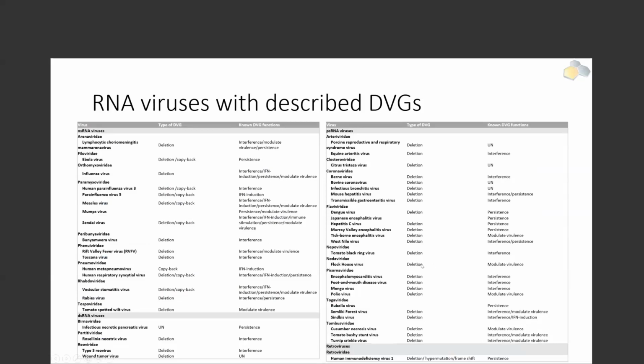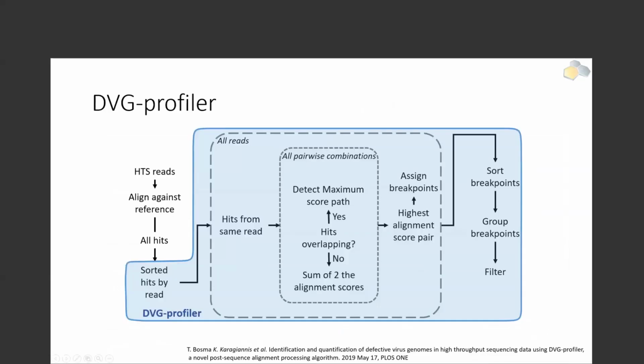And in our case, at least, what triggered this tool and this publication was mumps virus. So we focused on mumps virus, and we created this DVG-profiler.